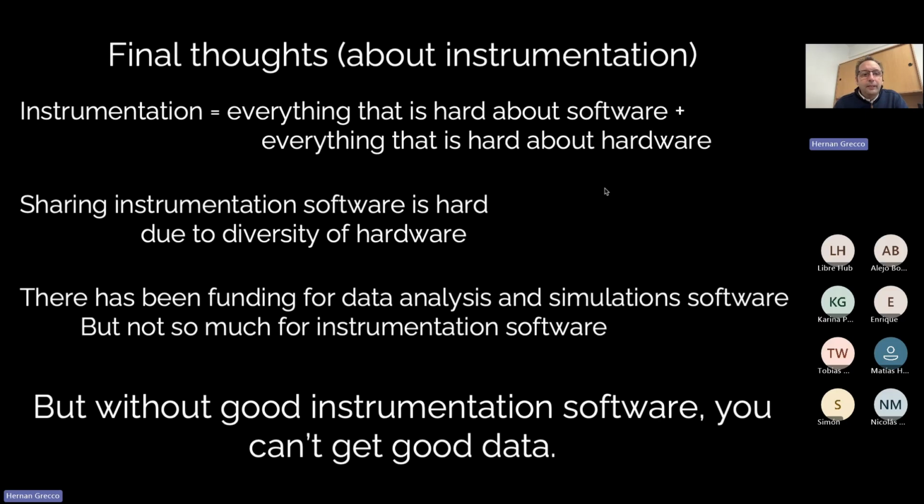Sharing instruments is hard because there's a lot of diversity in the hardware. So if I build a software to simulate, I don't know, like a random walk, and I give that software to you, it will run on your computer very likely. But if I give you a software to control a specific instrument, and you don't have the exact same hardware, it will be very difficult for you to adapt. Therefore, we need to incorporate into our development better techniques that allow us to build modular software and therefore be able to exchange more software.